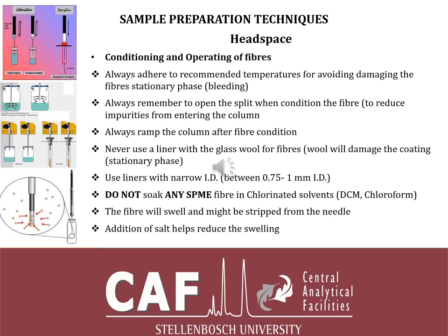And I always remember, when you condition the fiber, to open the split vent on the instrument to reduce impurities from the fiber entering the column, and also to ramp up the column after fiber conditioning, to make sure that all those compounds which will have been retained, trapped on the column, are flushed out.